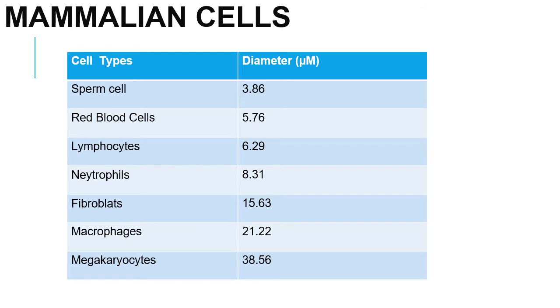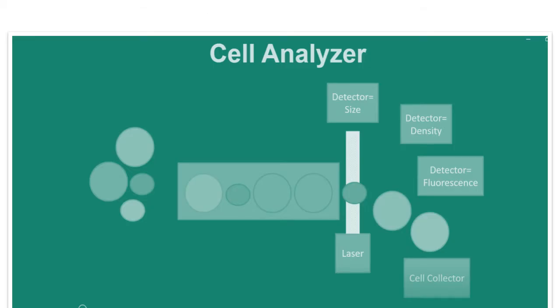For analyzing these cells, you are looking for a system which can actually evaluate these criteria for individual cells. First, you can imagine a cellular population where you have cells of different colors. Cells have different types of metabolic reactions, different types of cell surface receptors, or different sizes. Some are big cells, some are small cells. Irrespective of that, first you are looking for a system that can distinguish and analyze the cell mass and give a single cell.